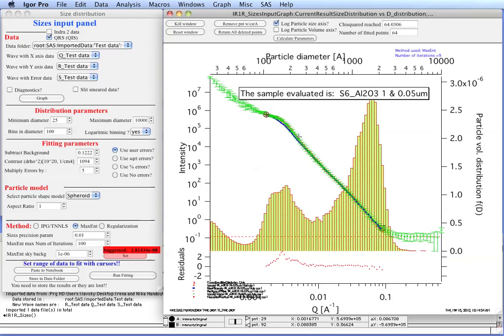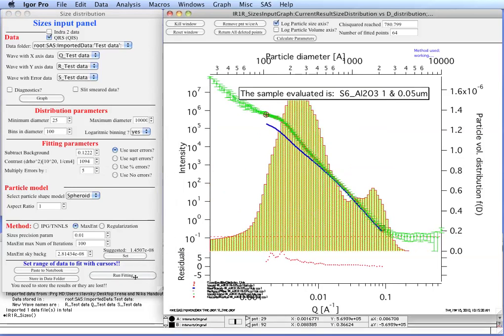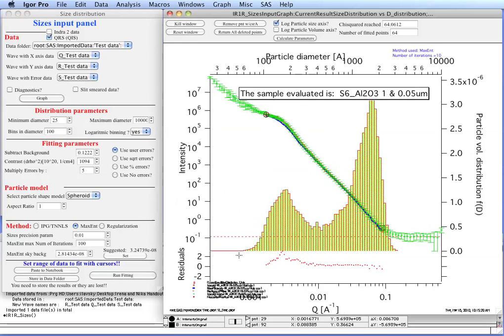Let's keep these parameters for now as they are and just do a run fitting here. You can see how the fit progressed. You get the fit. There is a misfit at this sizes here. There's a reason that they could fit out here. So it's already telling us that we have two size distributions. There's something here which you will actually see gets removed if we take this maximum entropy sky background, which is like a maximum entropy type flat distribution which it's using internally. Don't worry about that too much. If it comes up to be red, just hit SET button and rerun the fitting.